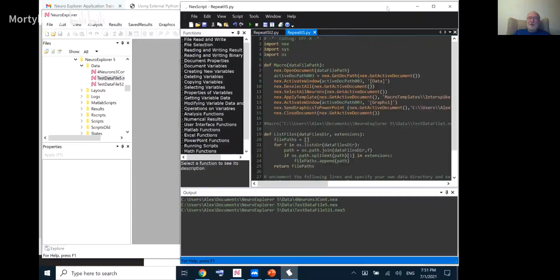Okay. Alex. Maybe I have one requirement. Maybe it's not rational, but sometimes our end users need to perform some functions, but they don't know how to script. They can give a description. Can you do some favor? I'm not sure how frequently, but for example, some special functions need to be performed. Can you help to give us a script? Then they can do the analysis. Yeah, sure. I worked with several customers that just wanted a very specific script. They had a paper.